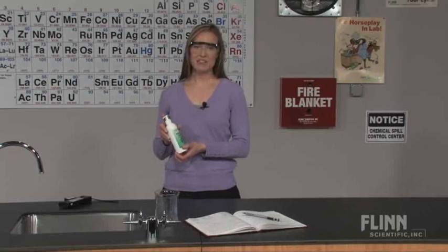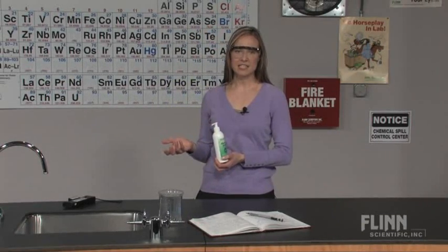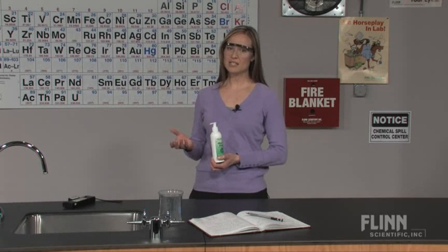This product is perfect for the beginning of the year, or to use in biology, allied health, and chemistry classes to show the spread of bacteria and other microorganisms or even spilled chemicals.